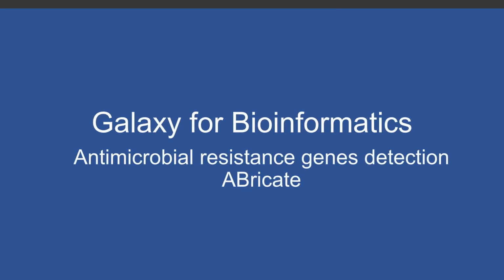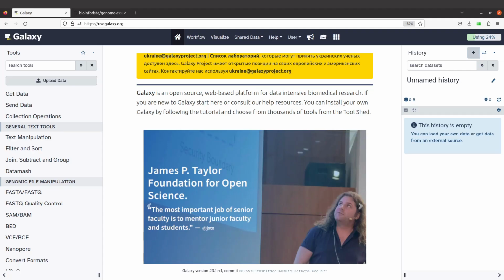Hi everyone, welcome to another episode of my tutorials on Galaxy for Bioinformatics. In today's video, I'm going to show you how to identify antimicrobial resistance genes on a Galaxy platform using the tool ABricate. So let's get started.